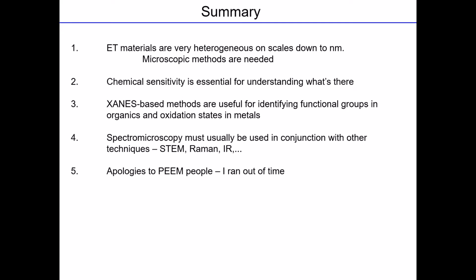The fourth generation synchrotrons, what's their impact as regards the practice of STXM? For STXM itself, maybe not as much. Well, it depends on whether you're on a bending magnet or an undulator. STXM is kind of a brightness limited experiment, so you could get a lot more flux. You won't get more resolution out of the STXM, but you'll get more flux. This may or may not be all that useful because of damage.